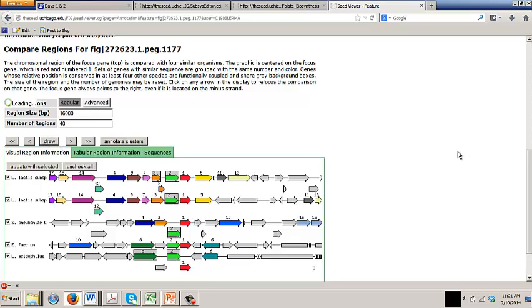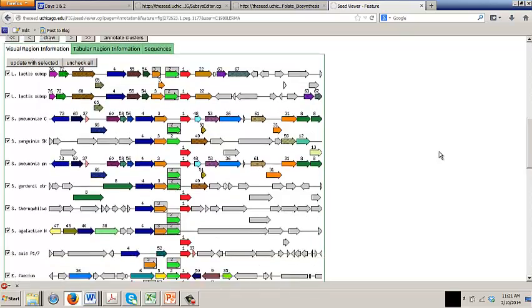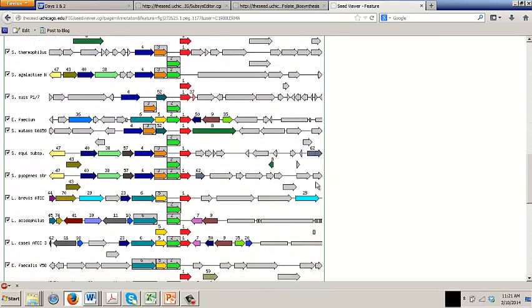It's an honest annotation, but maybe we can do a little better if we run the conserved domain tool, and that's what we're going to do. But first wait till you've got 40 of these, and mouse over them all, and you can see they're all called integral membrane protein. So this is an honest, useful, but not specific annotation.